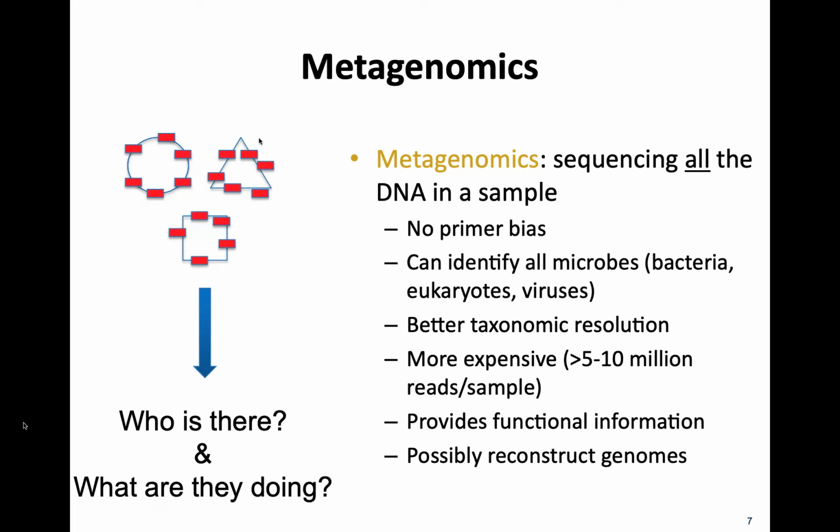Did you say 3 or 10? So the question is, how much sequencing do you need? I think people's comfort zone is probably in that 5 million reads per sample and up, typically. I think a lot of labs will do around 10 million. Our basic one at the IMR is 7 million. That's on average, of course, right? So you're going to get some samples with less, some with more.